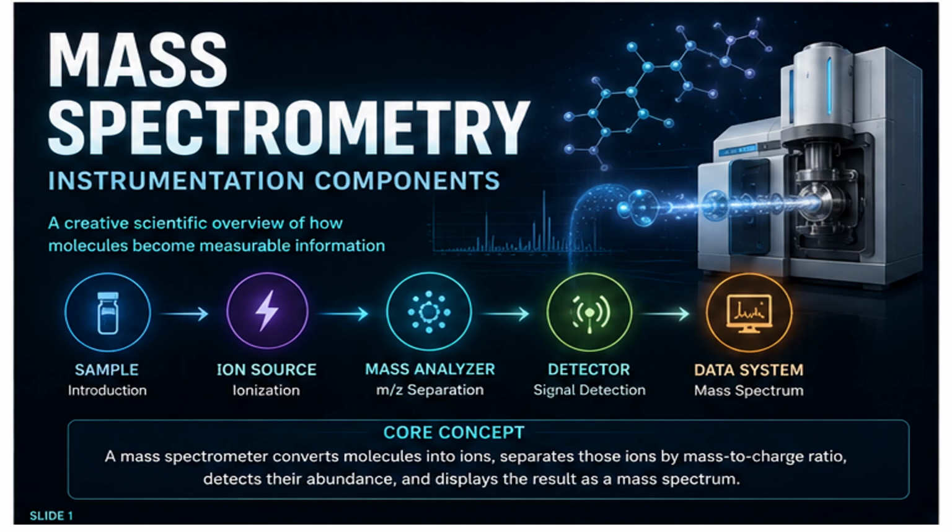Hello everyone! Today we are starting mass spectrometry instrumentation components. Mass spectrometry is a powerful analytical technique that helps us identify molecules by converting them into measurable information.